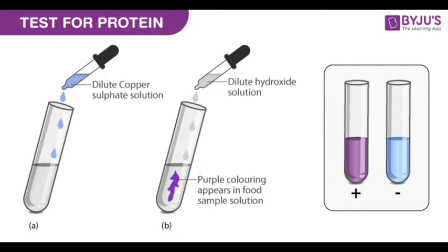Once the copper sulfate solution is added, see in the second picture, now they are adding diluted sodium hydroxide solution.